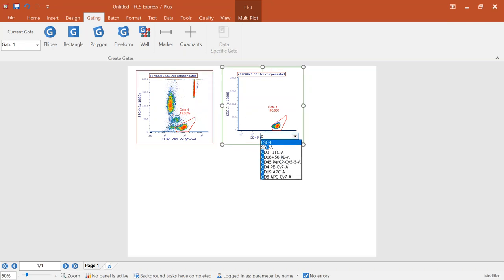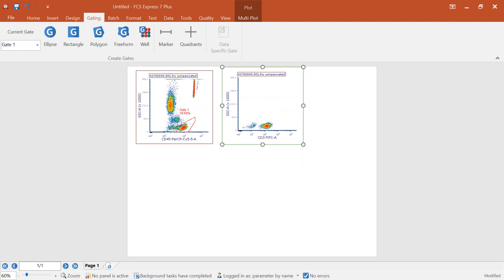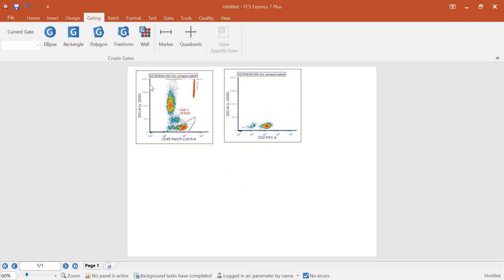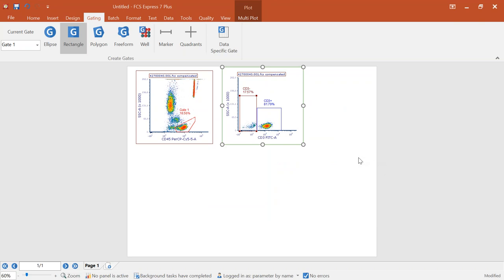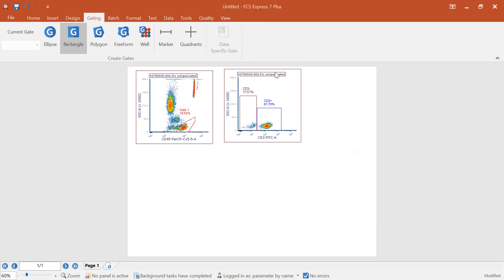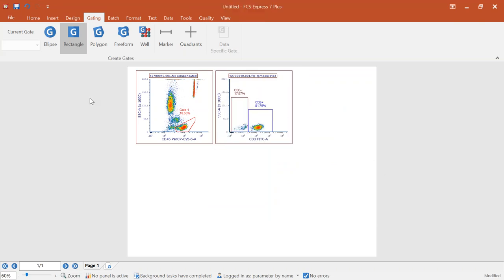In this plot, I'm going to change to CD3. As you start typing in FCS Express, if you have a very long list of parameters, you can type to access them. I'll create another gate for CD3 positives, pull this over, and another gate for CD3 negatives. You may be wondering where we manage these gates and view the hierarchies — we insert something called a gate view. The gate view is an object that will be printed and shows your gating hierarchy.